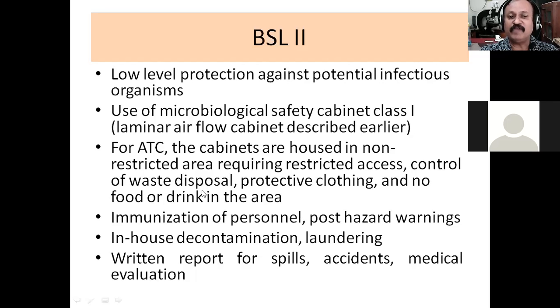Whatever waste is generated in that laboratory cannot just be thrown away as it is. It should be properly disposed of using the norms, taking certain precautions. You should always label it as biohazard material, and this hazardous material should be disposed of very, very carefully.